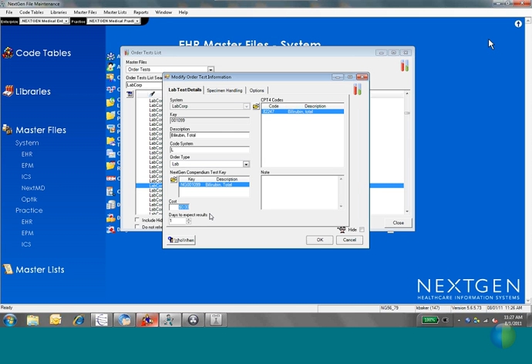There's an ABN form that can be printed and used. So you need to input the cost of the test so that the ABN form has that indicated on it. If it was, for example, $50, you can put that in there. Otherwise, the other two fields here you don't need to worry about.